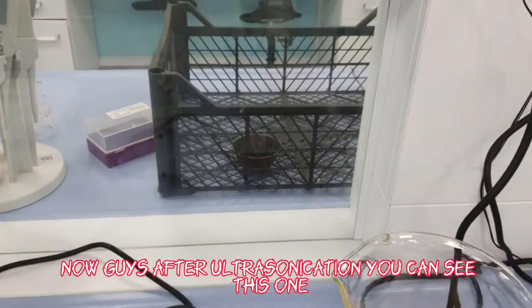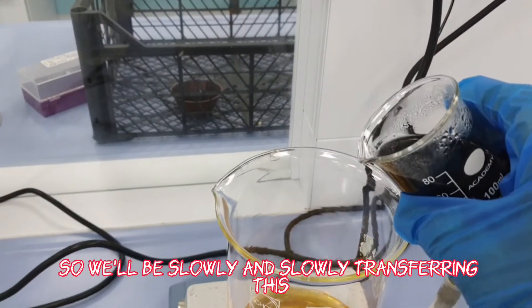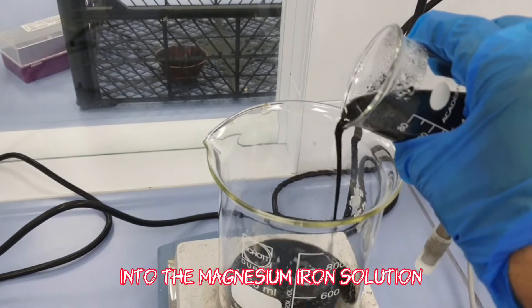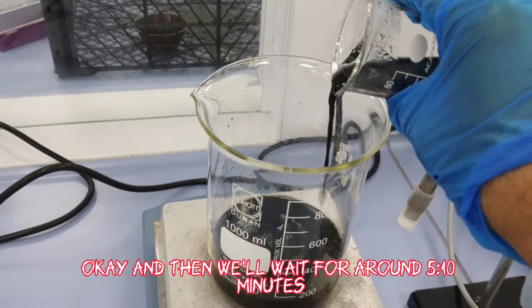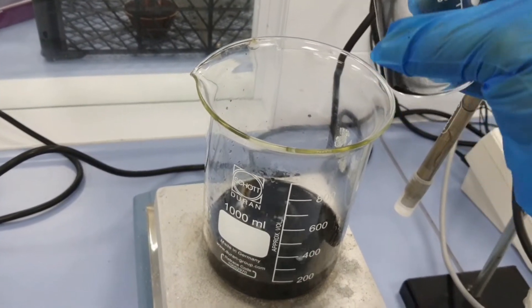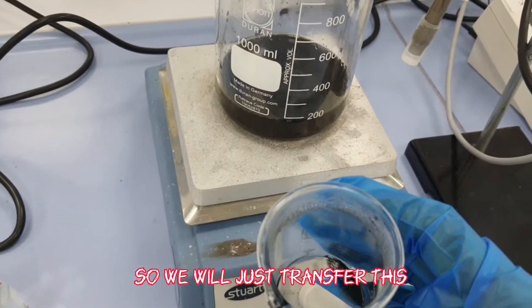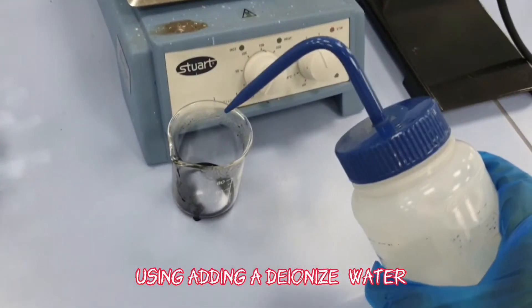After ultrasonication, we slowly transfer the biochar dispersion into the magnesium-iron solution and wait for around 5 to 10 minutes, mixing it very well. Any remaining particles are transferred using additional de-ionized water.